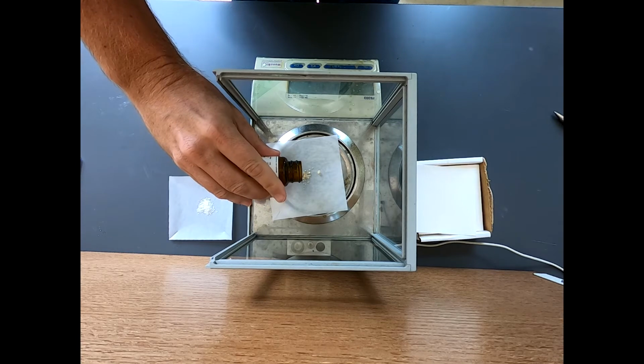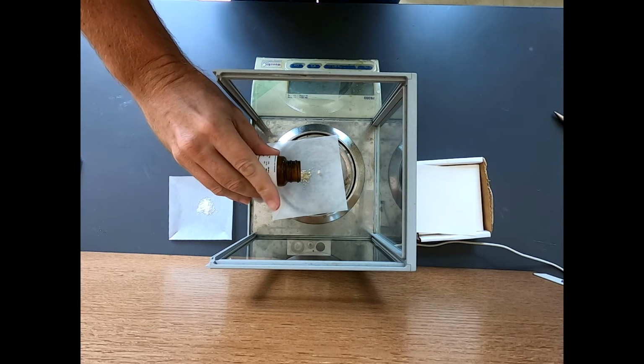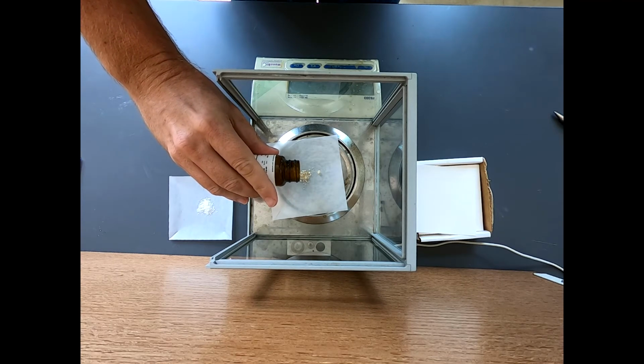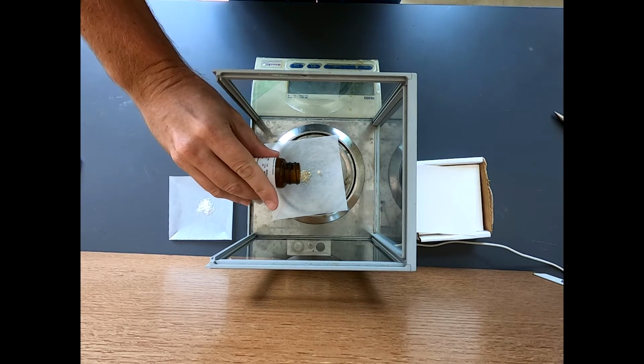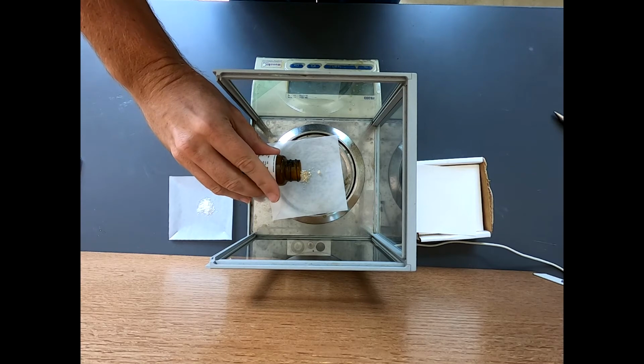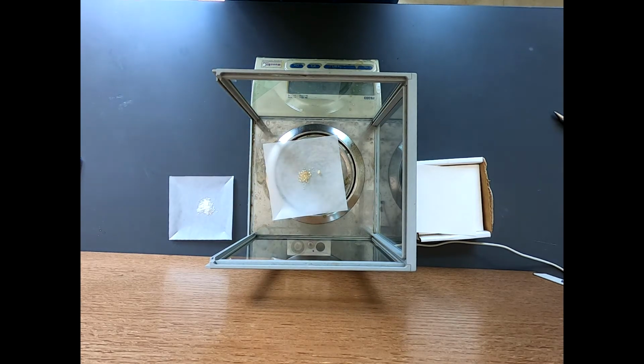So that's up to 114 mgs. You can see that has these little pieces, and they're pretty dense. Again, we're going for 204 or maybe less. Just under is fine. Oh, yeah, you just get greedy. Okay, that is 198 mgs. I think I'm going to stick with that.